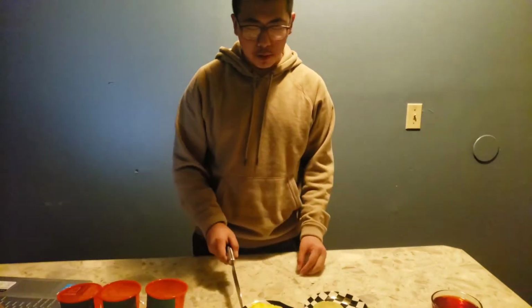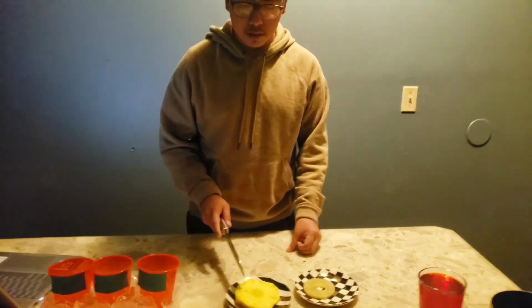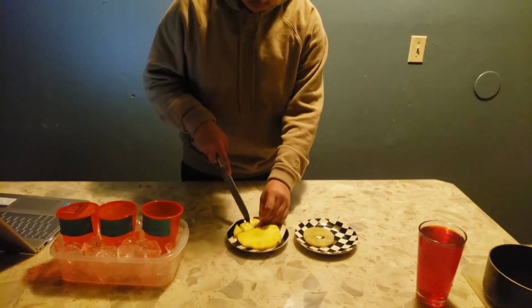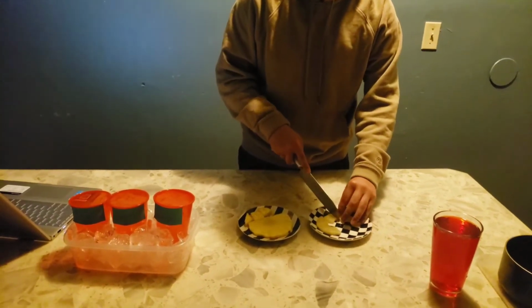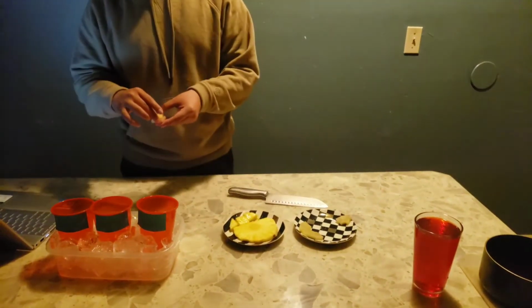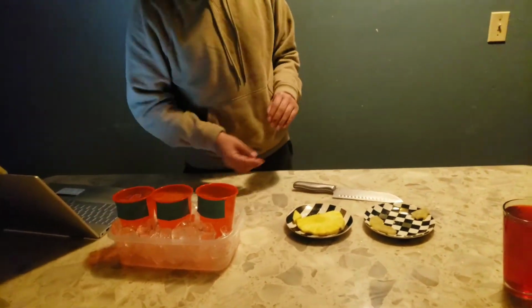I'll begin by putting 2 pieces of fresh pineapple into the cup and canned pineapple into the cup. So I'll begin with the canned pineapple, and then the fresh pineapple.